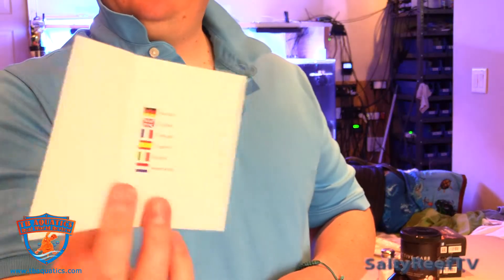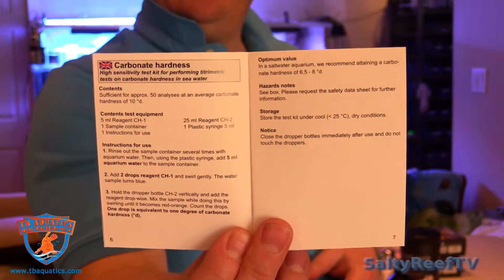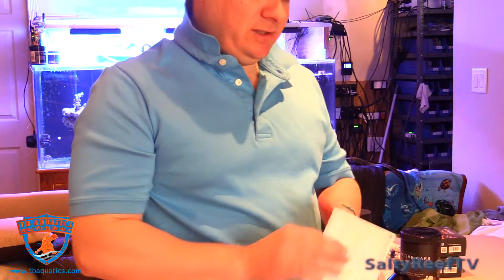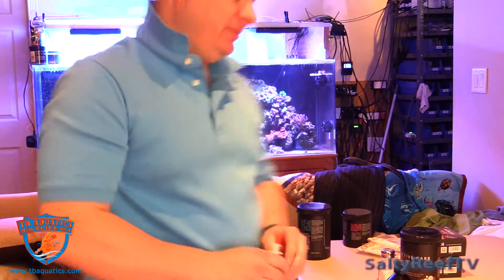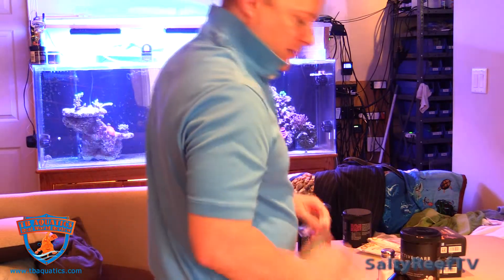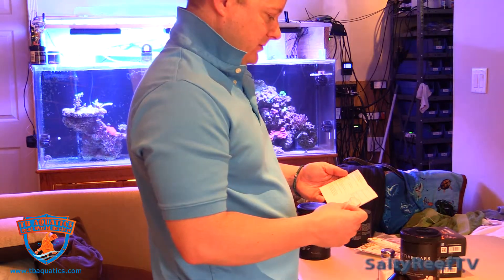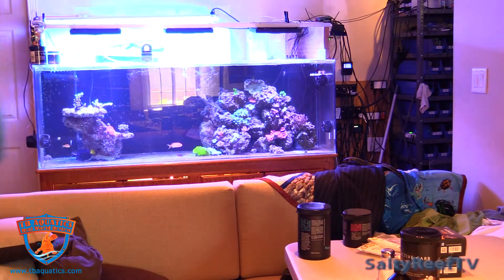The instruction manual covers several languages — feel free to pause the video for a closer look. It says the test kit is good for approximately 50 uses. The fact that I have to use two reagents means I'm not too excited about it, but I want to see how easy it is to read. It says to add five milliliters of water with a syringe, which I do like — the API Test Kit does not come with one. Then add two drops of reagent CH1.